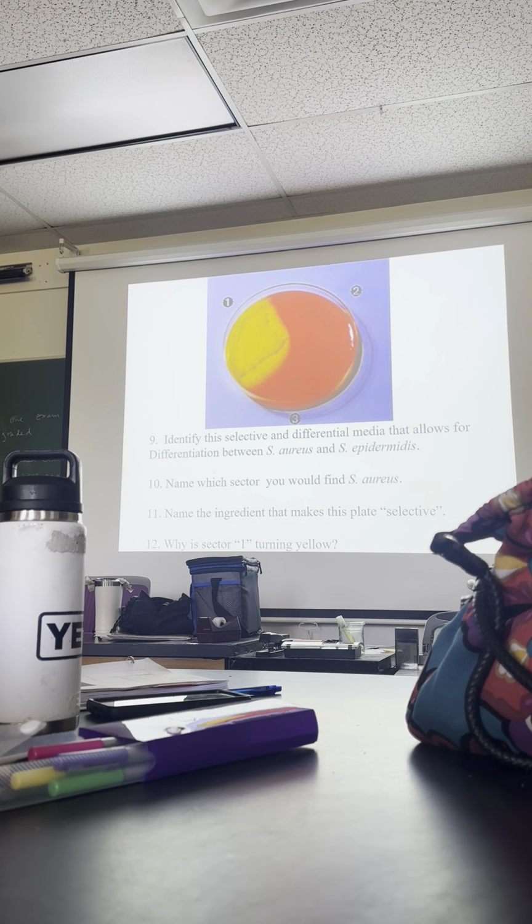Look, this is mannitol salt agar. Remember, if you know the name of the plate or the media, you know a lot about what's going on. What's the principal substrate of mannitol salt agar? Mannitol, which is a sugar. Why is salt part of the name? Because it has salt in it. What percent salt is in it? Not 6.5, it's 7.5. And why is it there?